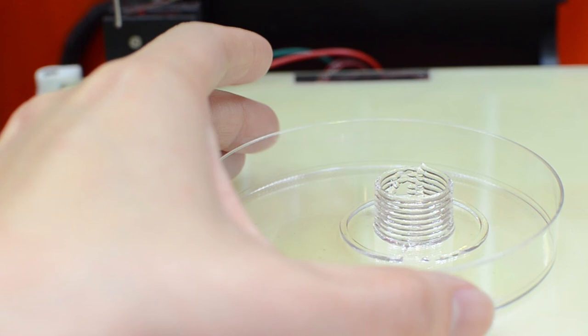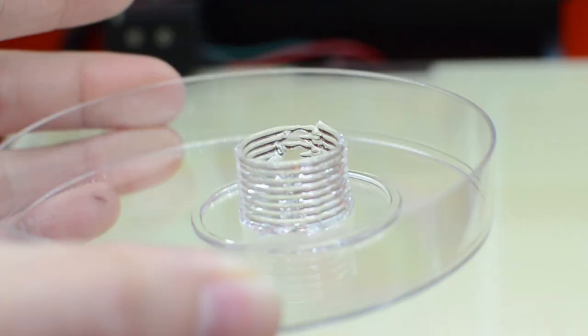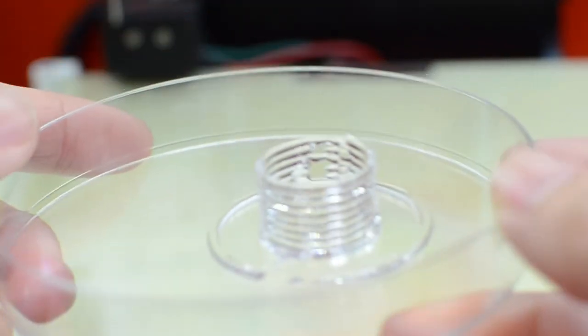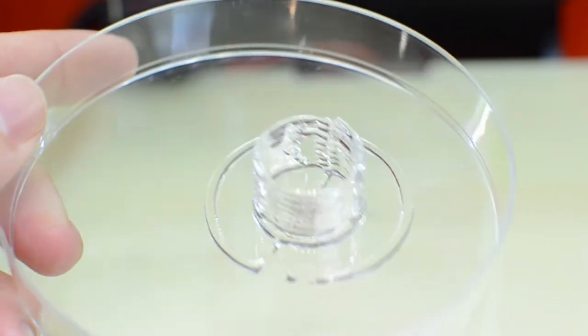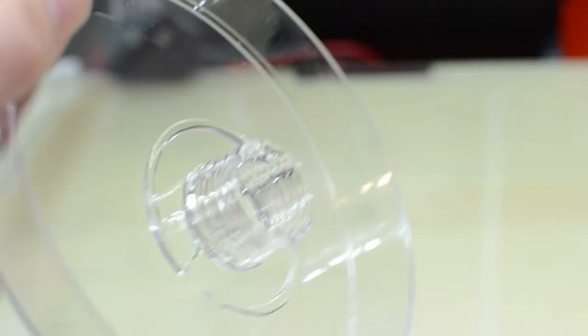Okay, so now that it's done, we can actually show you the scaffold. So you can see there's a number of layers. How many layers was this, Oliver? 6 or 8 layers. Yeah, about 9 layers. So you can see there's about 9 layers of prints on this one.